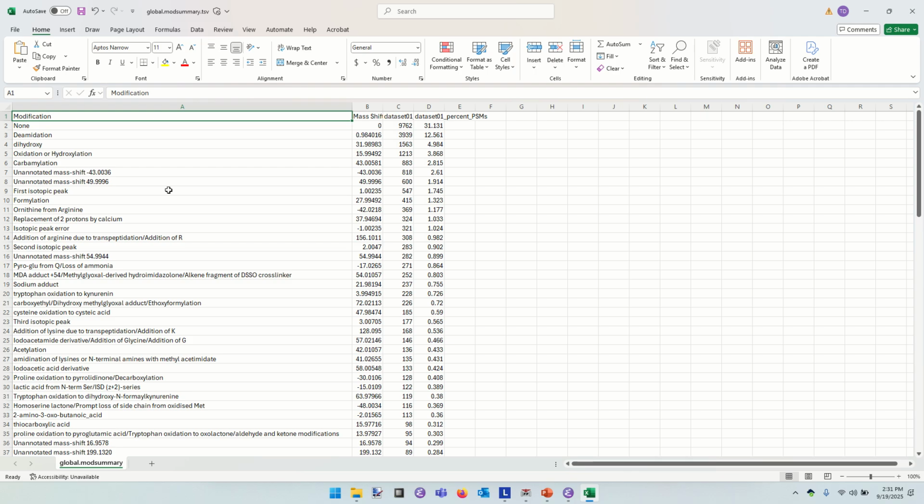Adding a mass shift of 0 shows up in plenty of different places. 31% of the PSMs overall included that. Look at the fraction of these deamidations that occurred. This is a case where a mass shift of 1 occurred between what we thought the mass should be based on the peptide and what was observed. So deamidation in this case was a really common outcome.